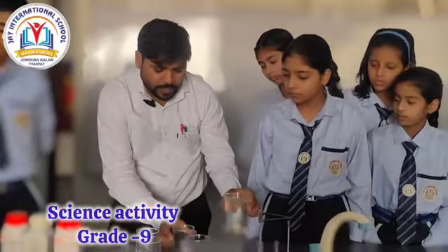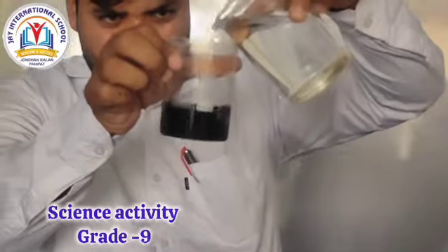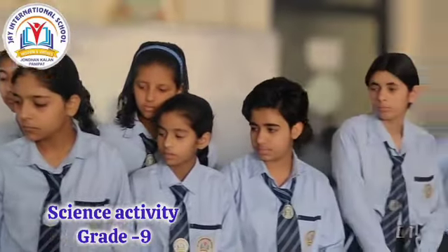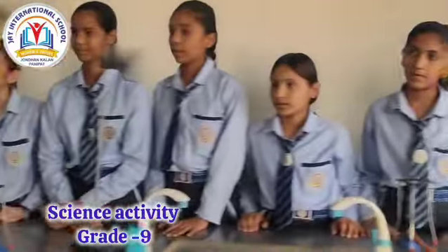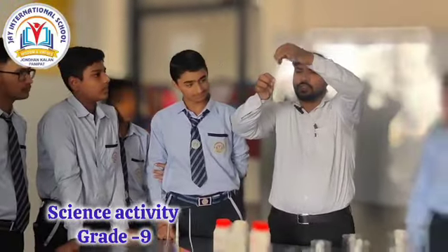Now, I add some water in this beaker, near about 100 milliliter, and this is also near about 100 milliliter, and we stir with the glass rod. And what is the color of this solution? Dark purple. What is the color of this solution? And what is the color of this solution also?